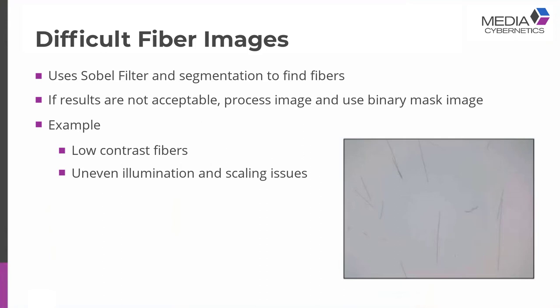Let's talk about some challenges. There's a wide range of fibers and a wide range of materials — what happens when you have a slightly challenging image? Here's an example: you can see the fibers visually, fairly good clean background. But when I run this image, some of these fibers have very low contrast — they really blend into the background. There's not much of a gray level difference between them. Also, if you have uneven illumination or hot spots, running Sobel filters or edge detection can be affected and that affects the results.